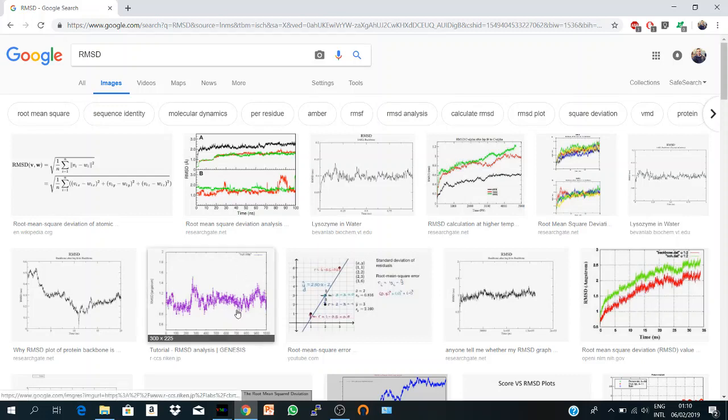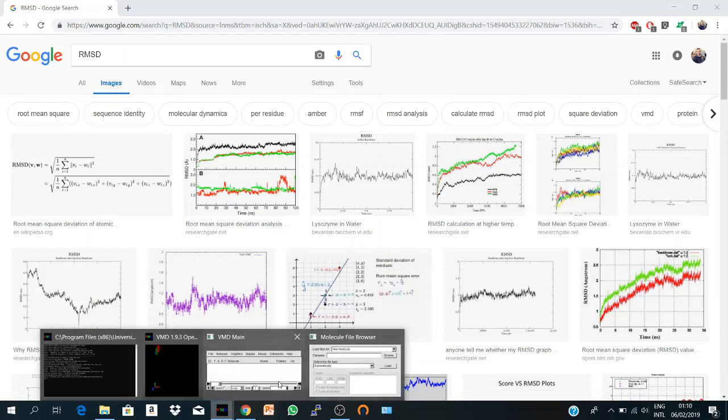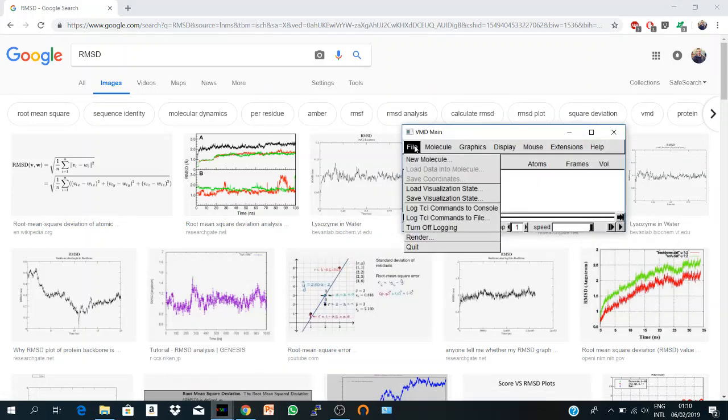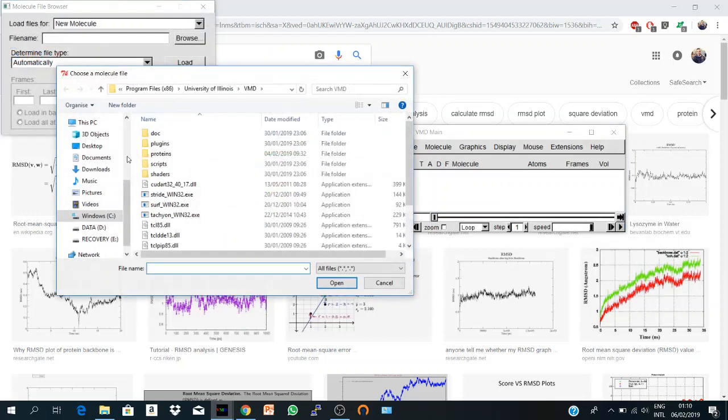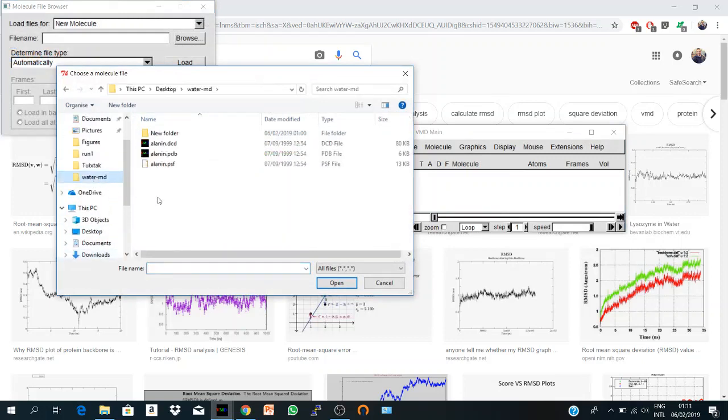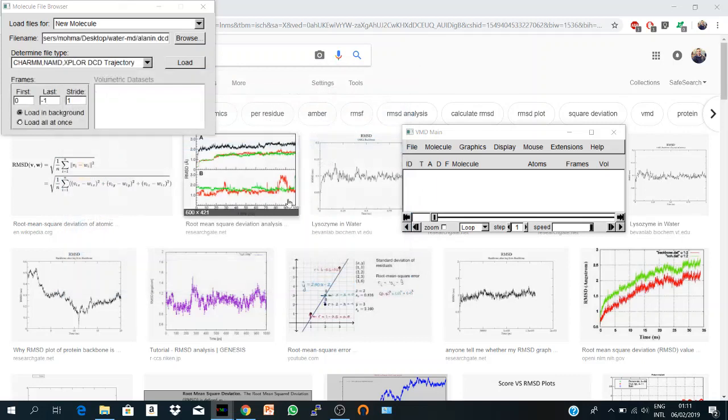To calculate RMSD with VMD it's very simple. You go to File, New Molecule and you search for your DCD. Here is mine, it's a very short simulation from VMD. It's given by default, alanine.dcd, and we load it. It's just 100 frames.